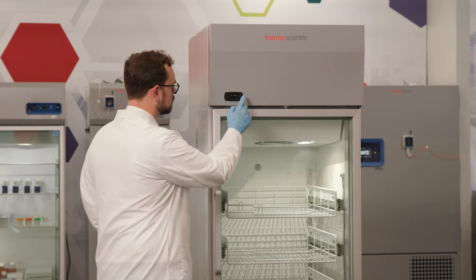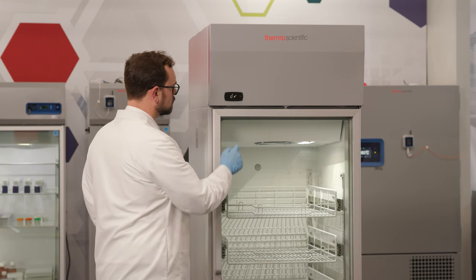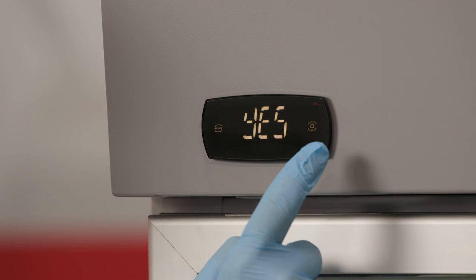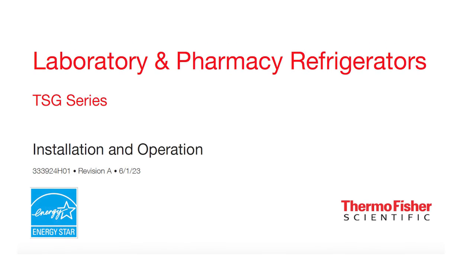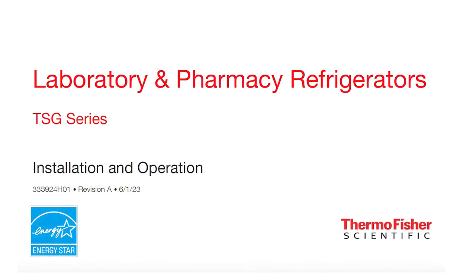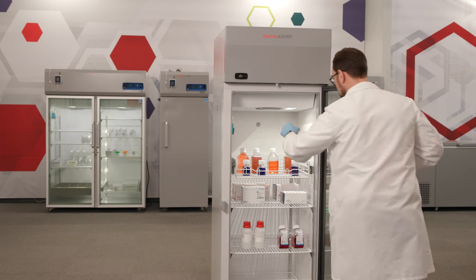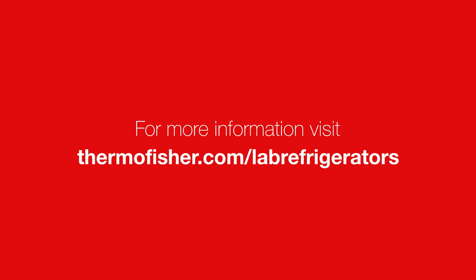Your refrigerator is now running and ready for any setting adjustments. View the Thermo Scientific TSG Series Refrigerator Controller Overview video and the Installation and Operation Manual for more detailed instructions. Enjoy your new Thermo Scientific TSG Refrigerator. Visit thermofisher.com/lab-refrigerators for more information.